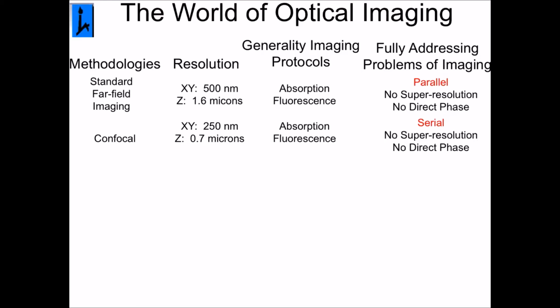But if you want to correlate the structure of something with its optical distribution, I mean its 3D structure, that's not the way. You can't do it by that method. You get a series of 2D images at different depths in the sample, and that's not what is called right. No phase. I understand, no phase.